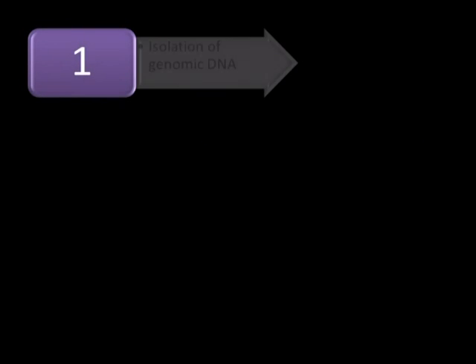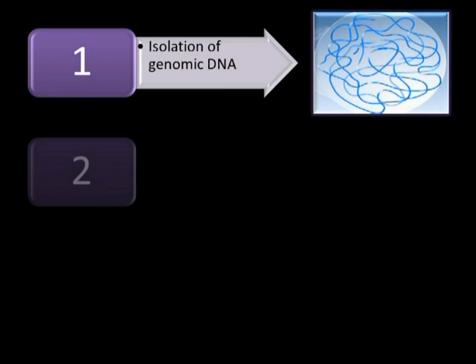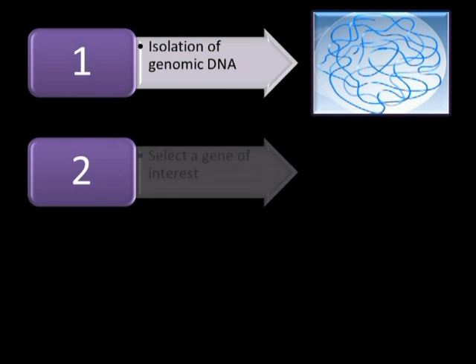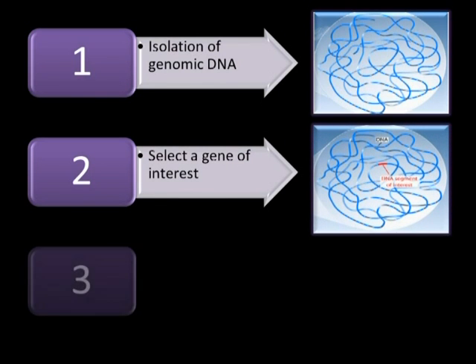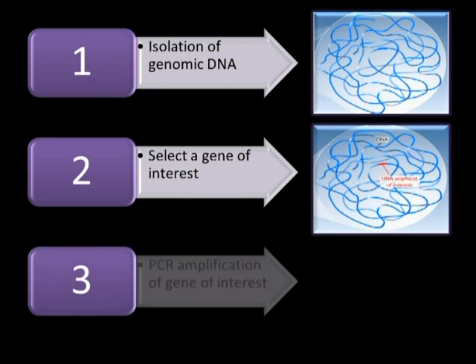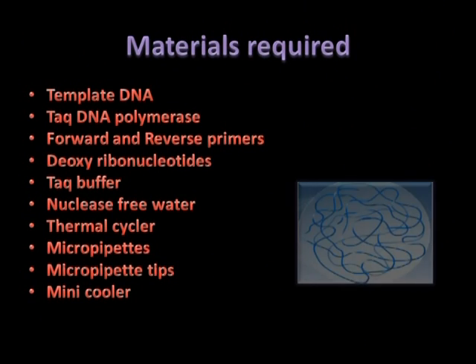There are different types of PCR: reverse transcriptase PCR, real-time PCR, nested PCR, step-down PCR, to name a few. We will see how to perform a standard PCR. As our first step, we isolated the genomic DNA from bacterial cells. After the isolation of genomic DNA, we next amplify the gene of interest using polymerase chain reaction.